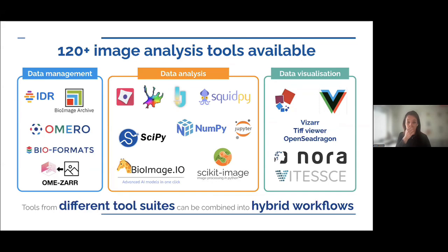And this is interesting as well, because in the same workflow, being this workflow a session of different tools that are chained, this will enable you to use your favorite tool for the particular task that you're interested in. So maybe you want to use some model in Cellpose, then you do it. And then maybe you like analyzing the features with CellProfiler. So you can chain these things together. And in the end, you have a workflow that is fully reproducible that you can share with others.